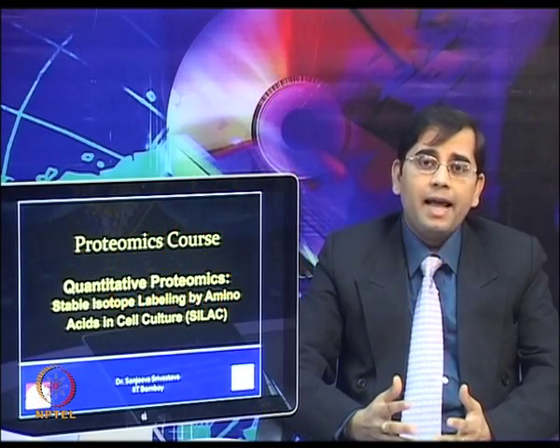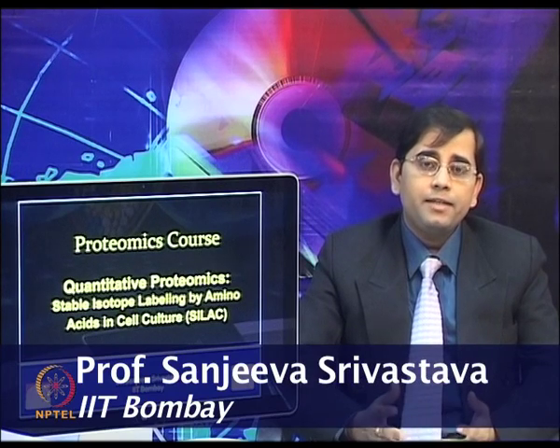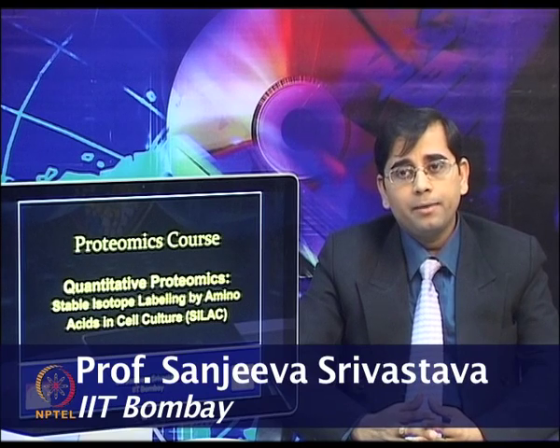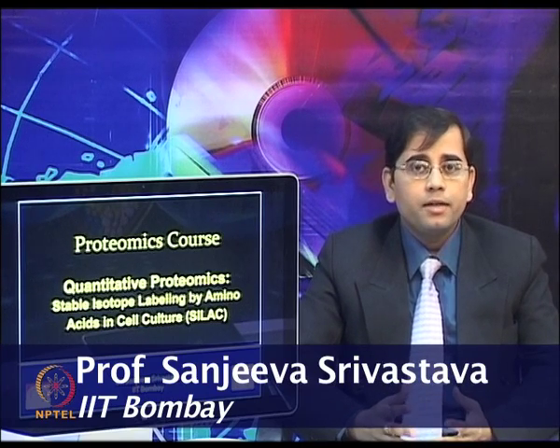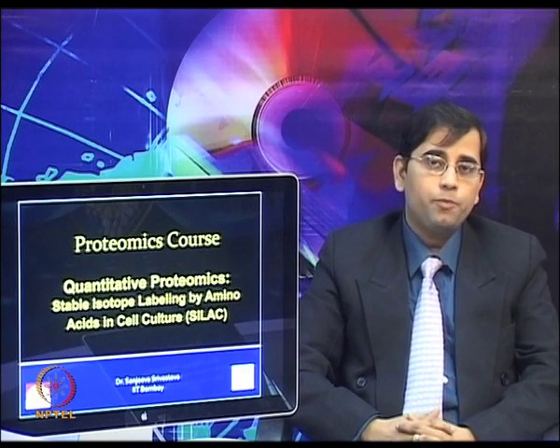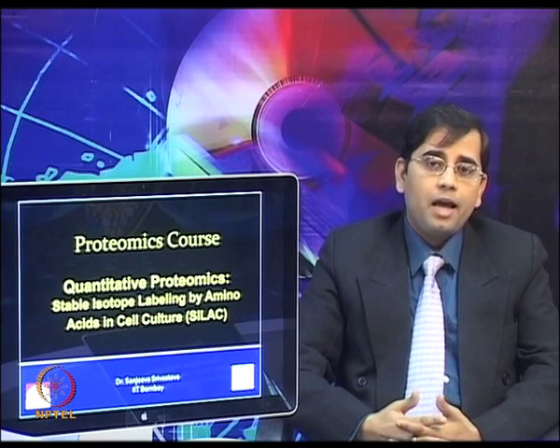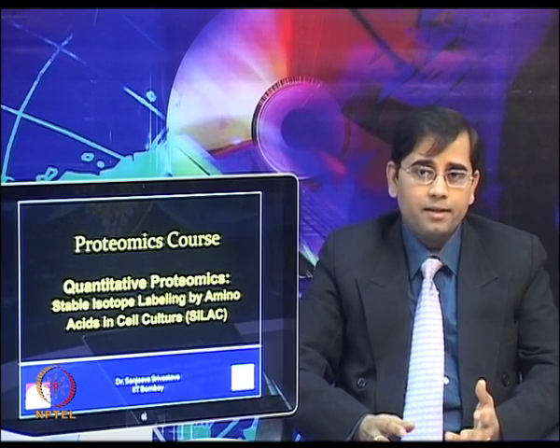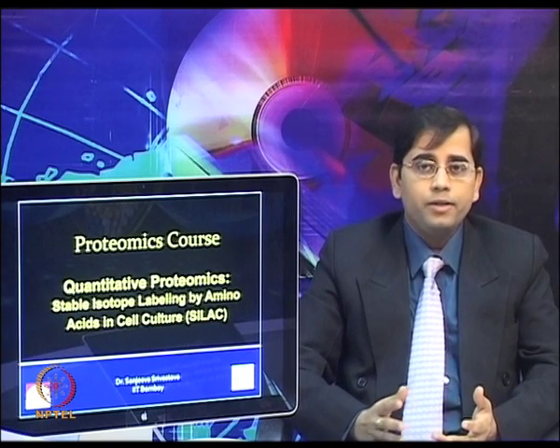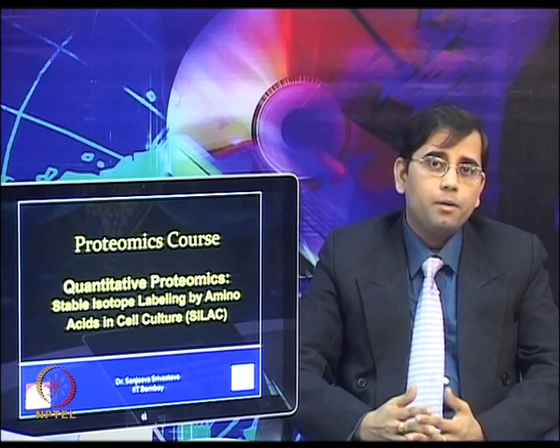The complexity and dynamic nature of the proteome present major technological challenges. Mass spectrometry advancements have improved the high throughput identification and quantification of proteins. The mass spectrometers have advanced significantly and are now offering opportunities to understand human diseases and discover biomarkers.